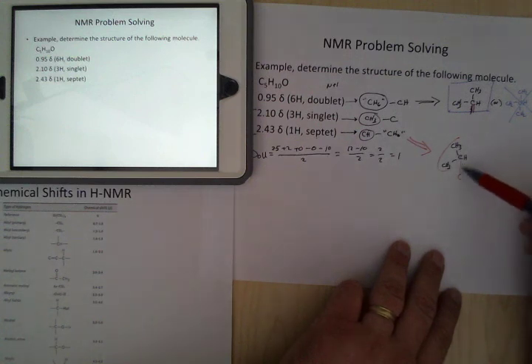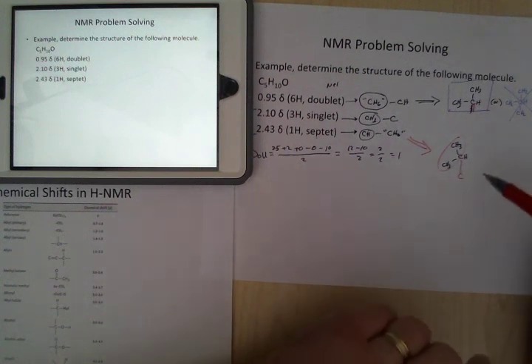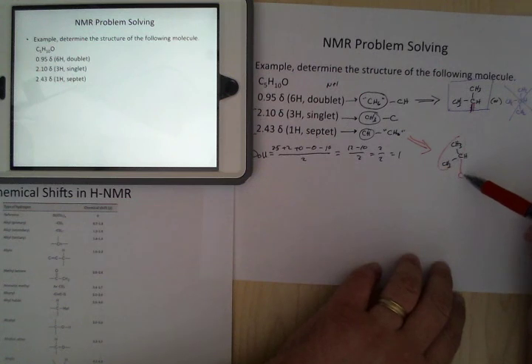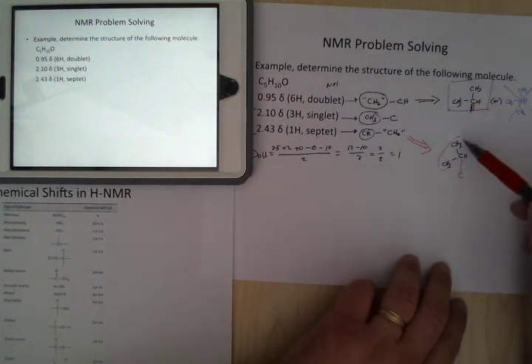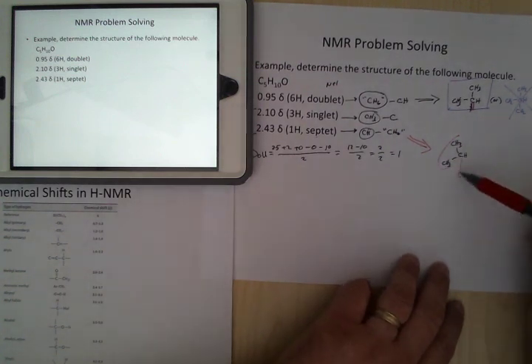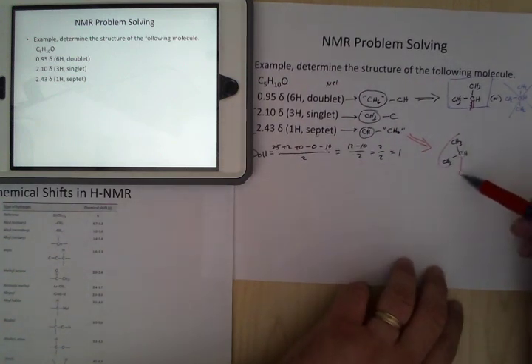So this one almost has to be connected to something that doesn't have any hydrogens on it, okay? Because otherwise this guy would be a neighbor, and it would split again. So you would get the septet from here, and if this was a CH, you would have a doublet of septets. So we have to be careful. So there's going to be something here.